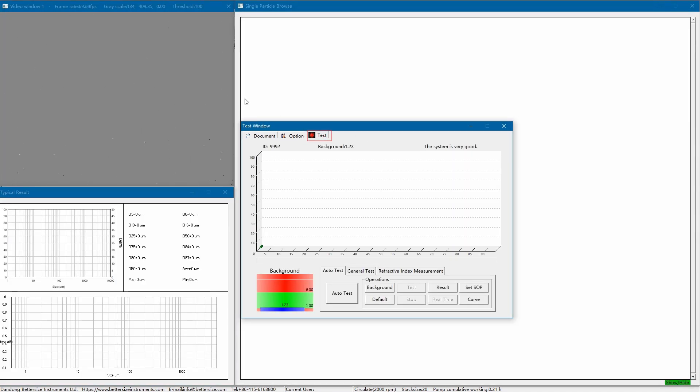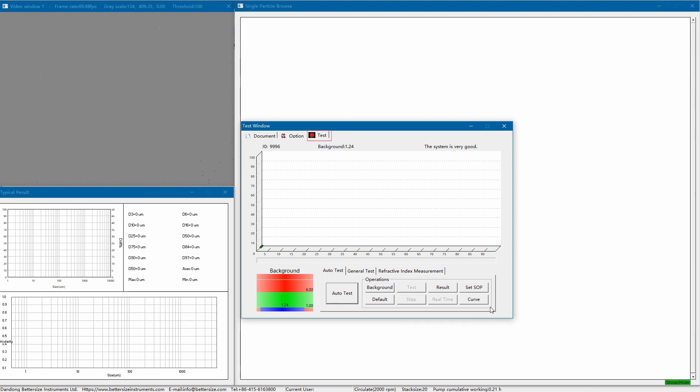Several new windows pop out instantly. I'll explain them in detail later. Let's focus on the test window first. The Betasizer F3+ has three measurement modes to choose from: auto test, general test, and refractive index measurement.